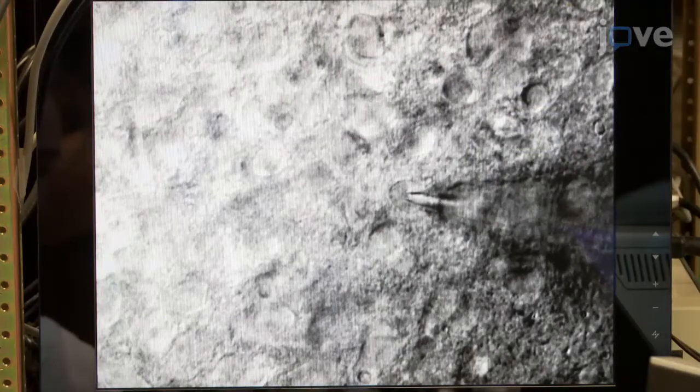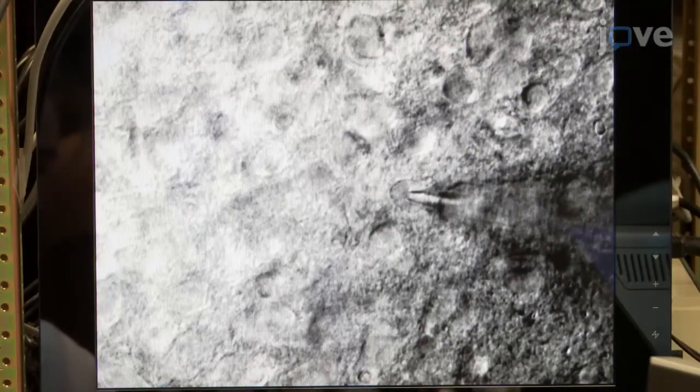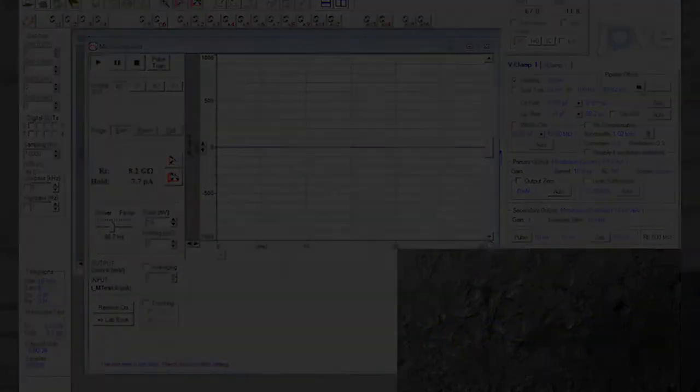Subsequently, slightly pull the pipette away from the cell diagonally to remove excess pressure. Compensate for the fast capacitance.